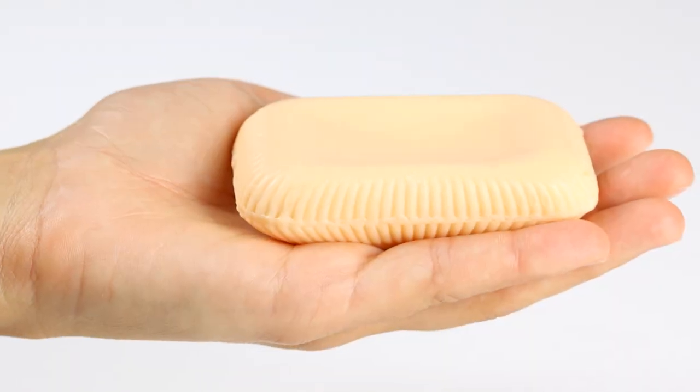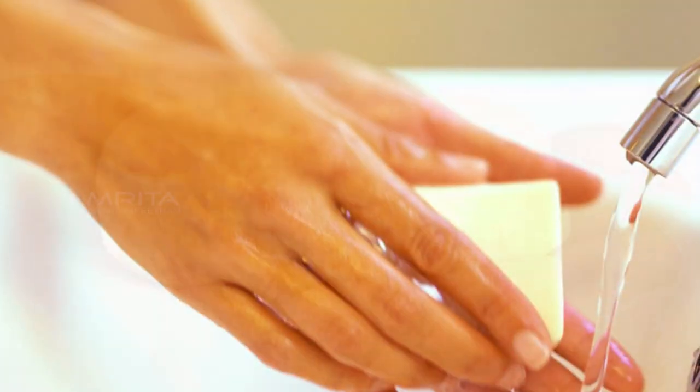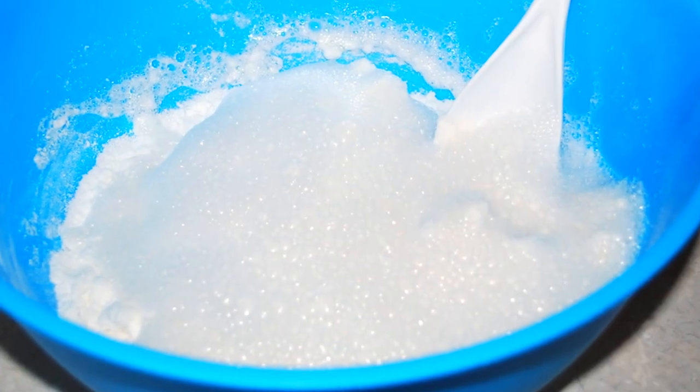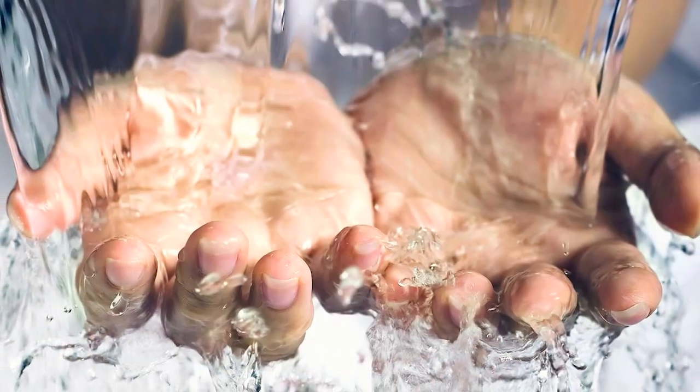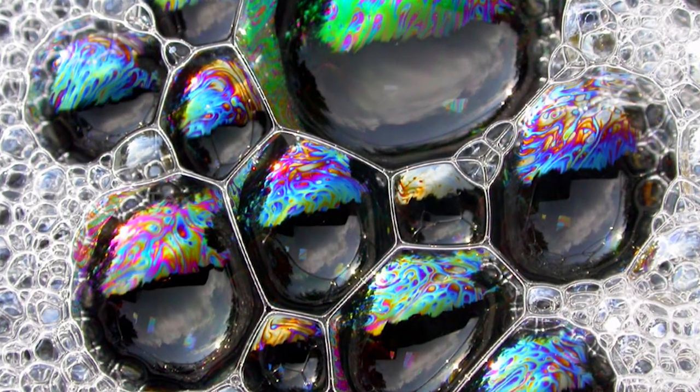All soaps are not equally effective in their cleansing action. The cleaning capacity of soaps depends on their foaming capacity as well as the type of water used in cleaning. The soap with the maximum foaming capacity has the best cleaning capacity.